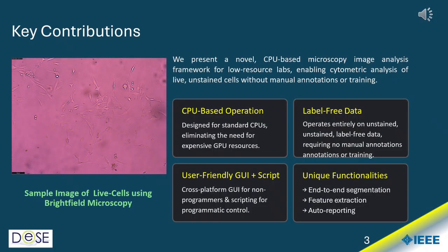Our key contributions include a CPU-based microscopy image analysis framework on label-free data. We provide a cross-platform interface, an easy-to-use GUI for non-programmers, and scripting support for advanced users. Key features include end-to-end segmentation, feature extraction, and automatic reporting.